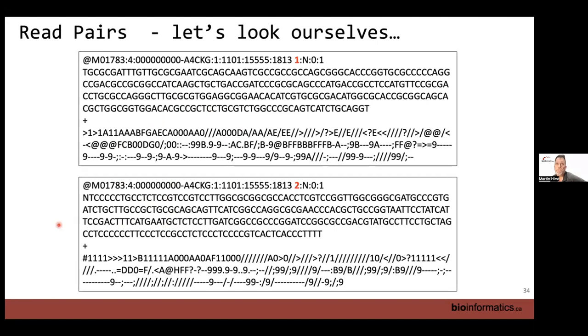And this is the default that comes out of an Illumina system. But some of you might, for example, be given a BAM file, so given an alignment file, and have to convert it back to a FASTQ file. And if you have to do this, remember that you need to rename sort the outputs before you then go into a realignment step.